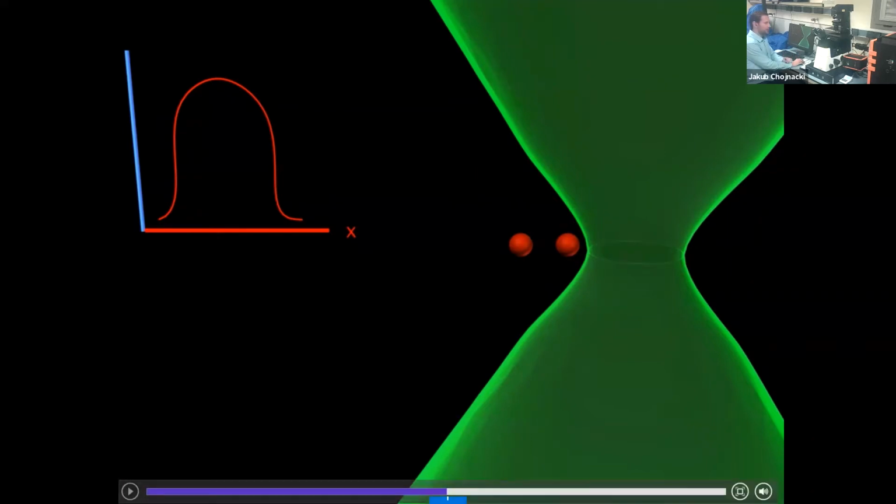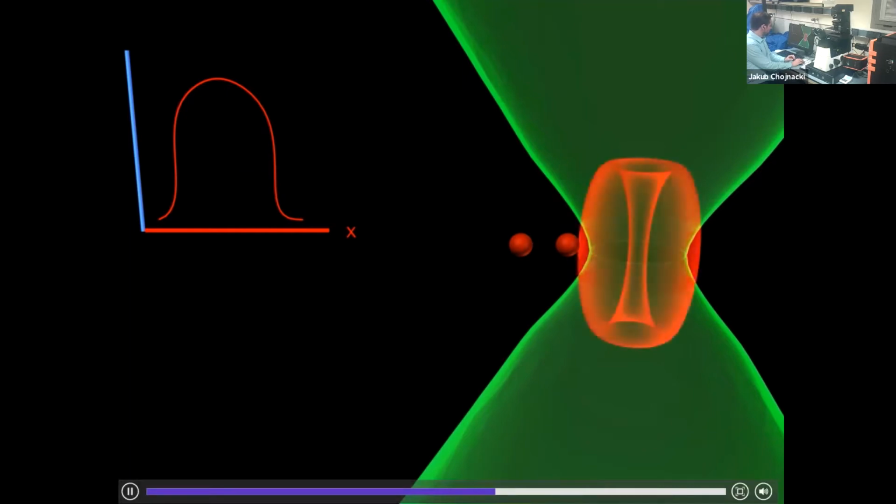Now, STED super resolution microscopy overcomes this limit by introducing a second laser into the mix. And without going into too much detail, this laser has 2 features. First of all, it has a specific wavelength which allows you to inhibit fluorescence of the molecules that are present within the field of this laser. And second of all, this laser has a very interesting shape. It has the shape of a donut. You may have seen some donuts that I put on the title page. This donut has a very powerful laser intensity in these areas, but has a 0 intensity in the middle.